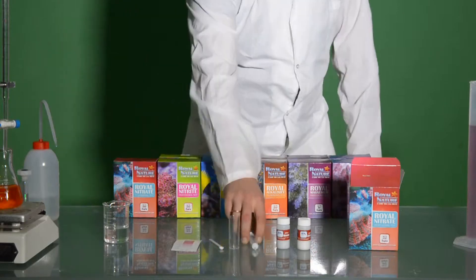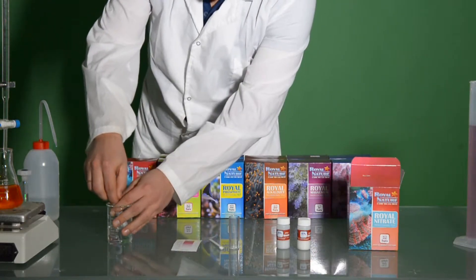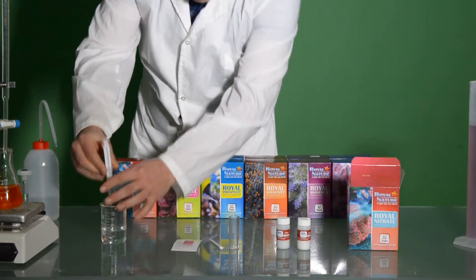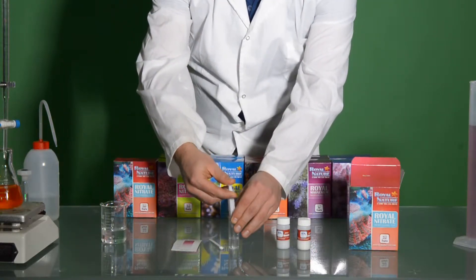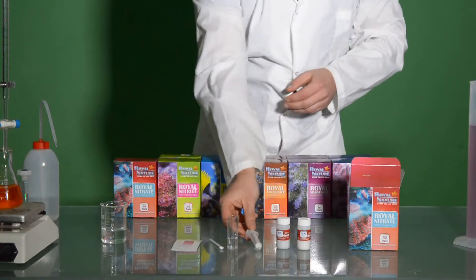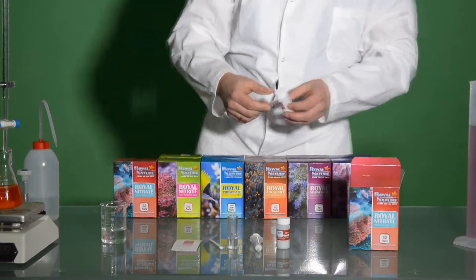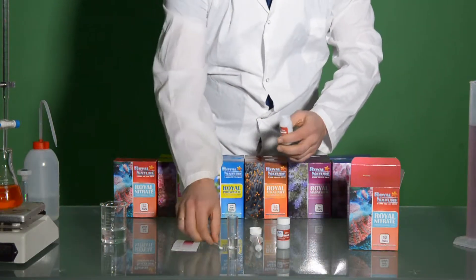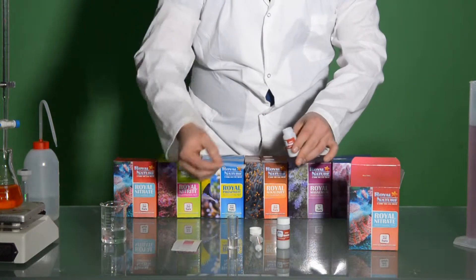So let's start with the test. We'll take firstly 5 ml of aquarium water into the test vial. In our case, we took a fresh mix of Royal Nature salt in order to see if there is any nitrate content. We'll add one level scoop of NO3-1 and swirl gently for 5 seconds.